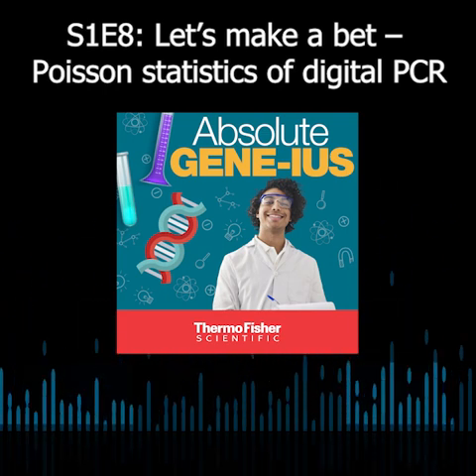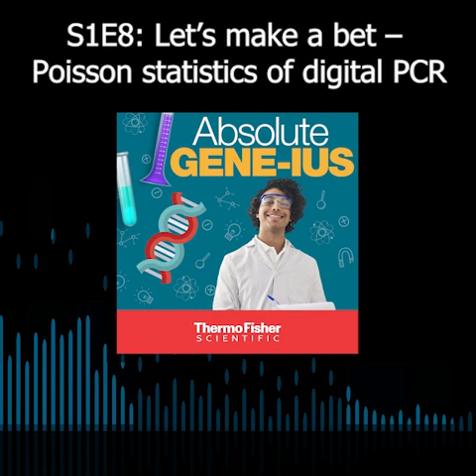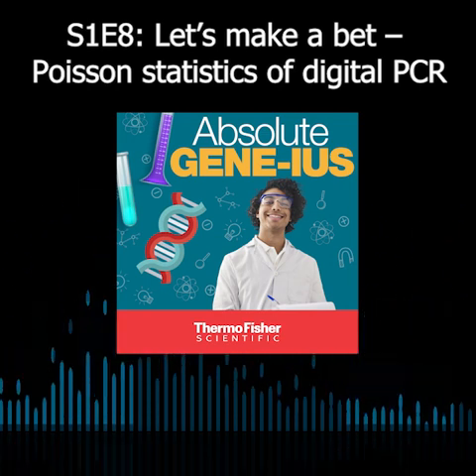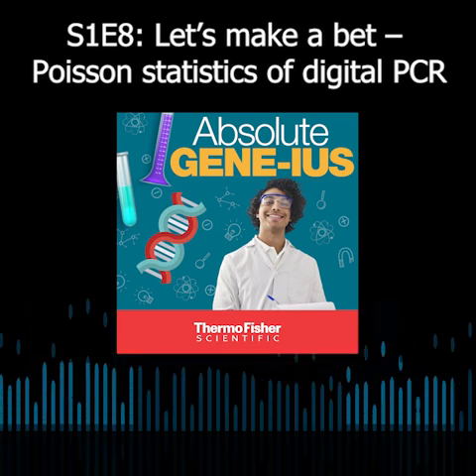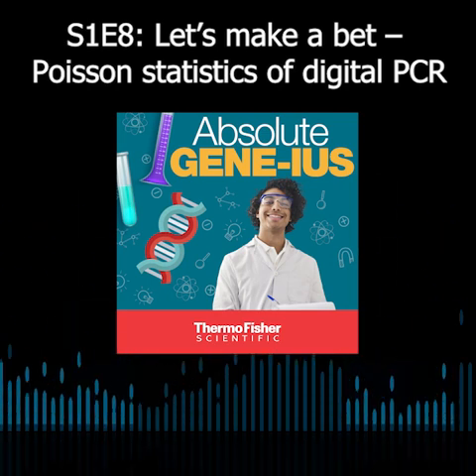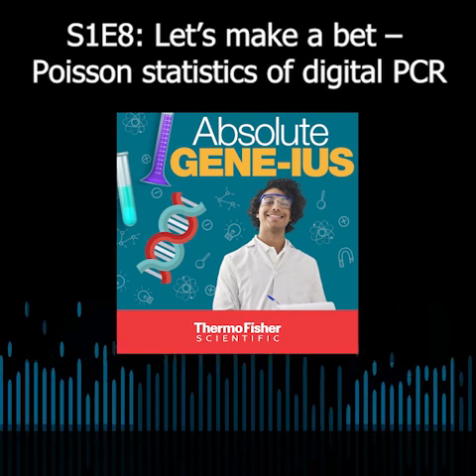It can. So in a perfect assay, you have a cloud of positives that are clearly separate from the cloud of negatives. In those cases, the threshold doesn't really matter where you put it, but there are times where you have some chambers that are weakly bright. Maybe there's some inhibitors present. Maybe your assay isn't operating perfectly in the PCR reaction. And then some of the chambers have signal that's close to the middle and a little bit harder to say exactly what it is. Or you might have cases where there's something about the sample or the technology that's giving a background fluorescent signal.